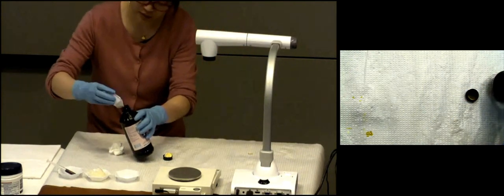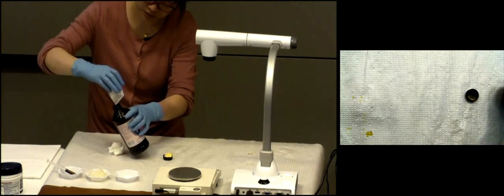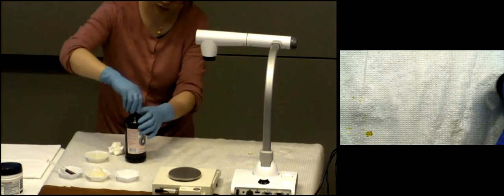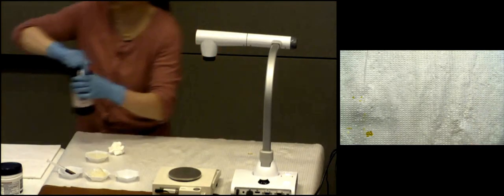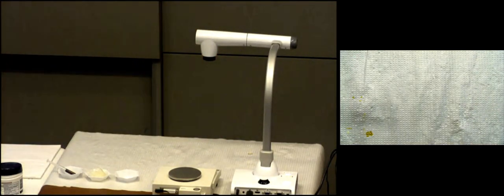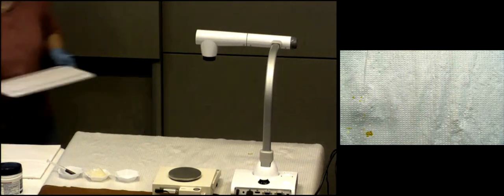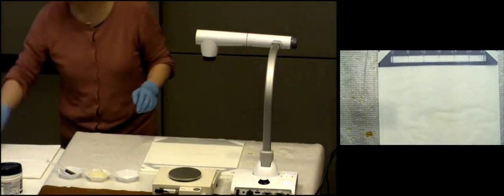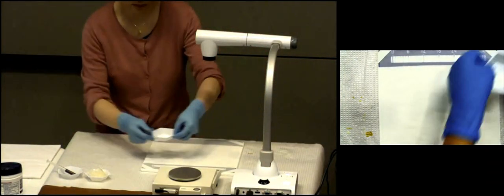While Judy's doing that, I want you to look at step 3 in your procedures. There's an important change to some of the terminology. Starting on the first sentence, midway through where it says "and wet the powder," circle the word wet. That is what you're doing, but that's not the most appropriate term. So change the word wet to what? Levigate. What she's going to be doing here in a minute is levigating, which is in fact wetting.